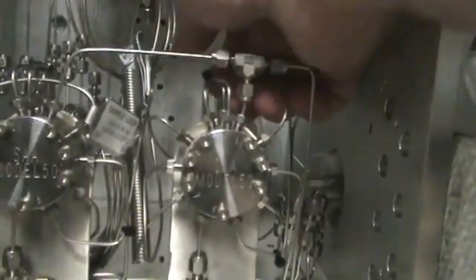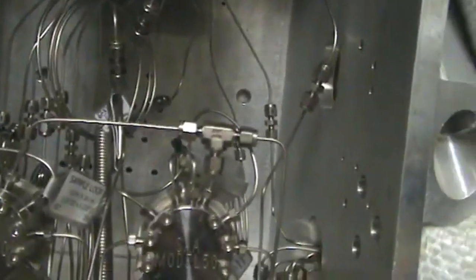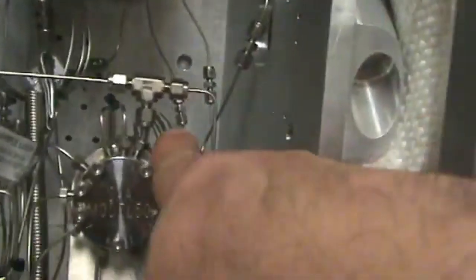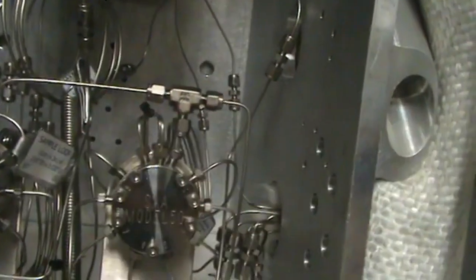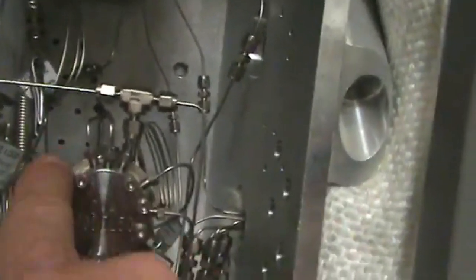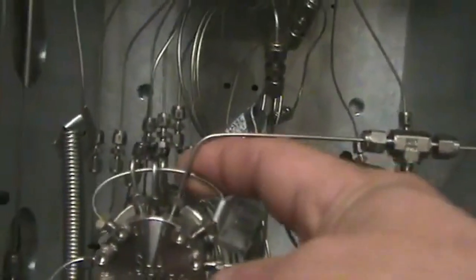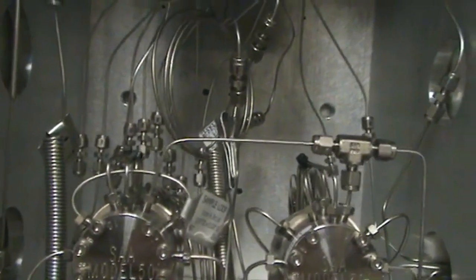Sample loop in this case goes behind the valve. But you can see there's your sample loop. It goes from there to there externally. Then internally, we're going to go to 10 and back out. Same thing here, and here's our sample loop. It's a smaller sample loop. That's probably because that's the bigs. The bigs do not need a bigger sample loop. The lights, a little bit bigger sample loop.